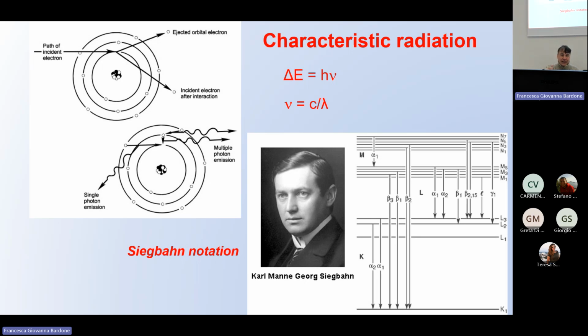But the energy of each line of every X-ray is specific to the quantum jump. And every atom of the periodic table has its specific energy jumping steps. So if you measure the energy of the X-ray, automatically you have the information of the chemistry, not only from one line, but from all the lines associated to all the jumps.